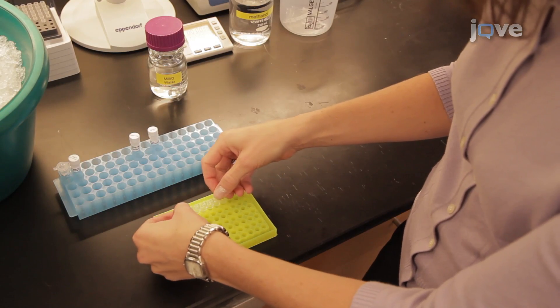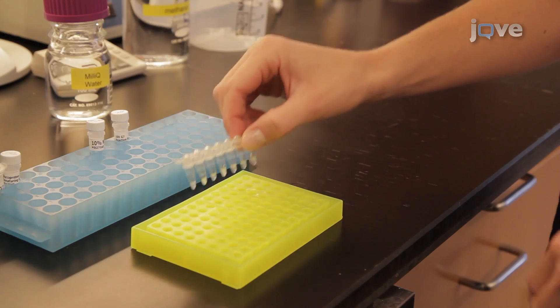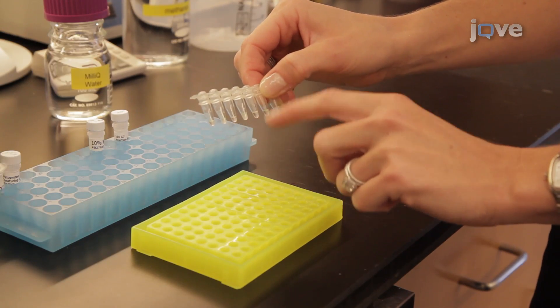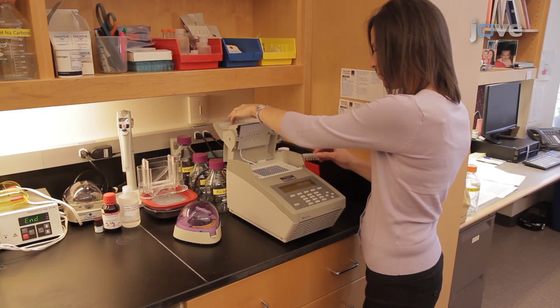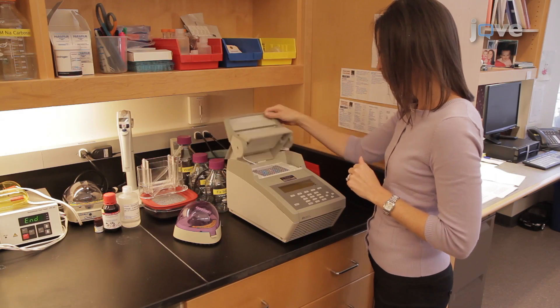Close the PCR tubes using new caps, then mix the tubes by gently tapping 4 times. After spinning down the contents, place the tubes in the thermocycler.